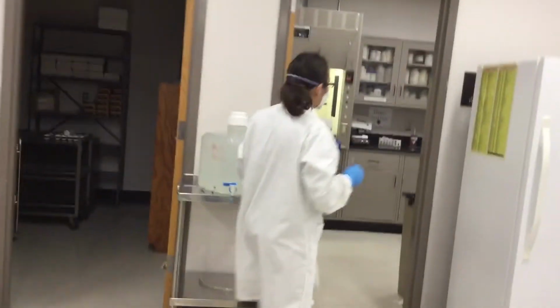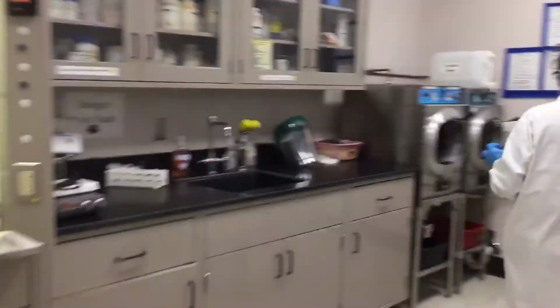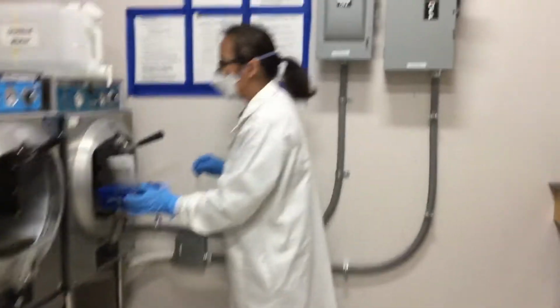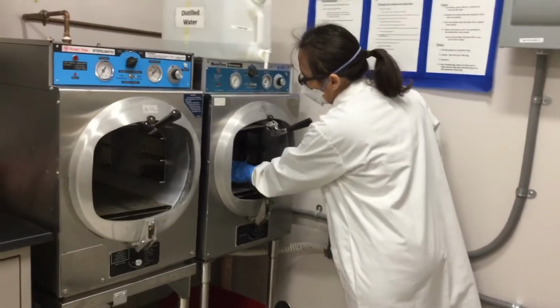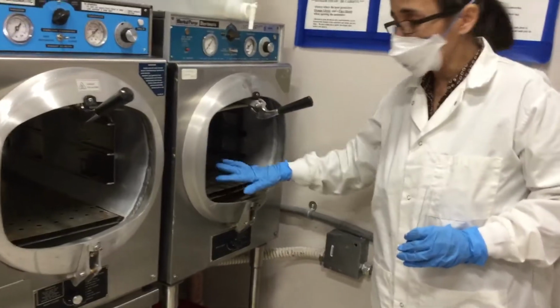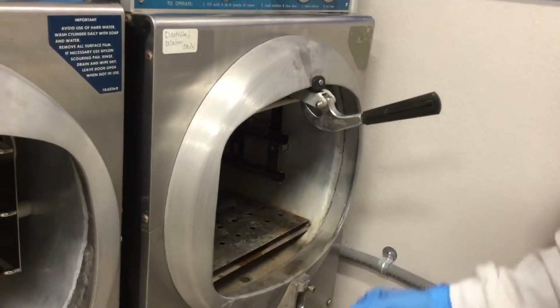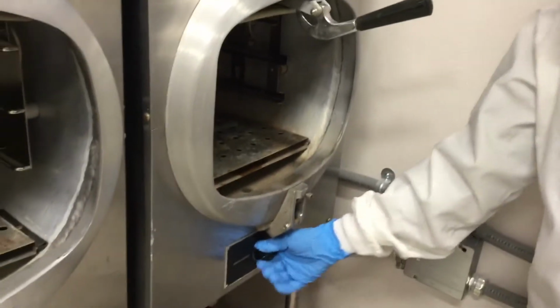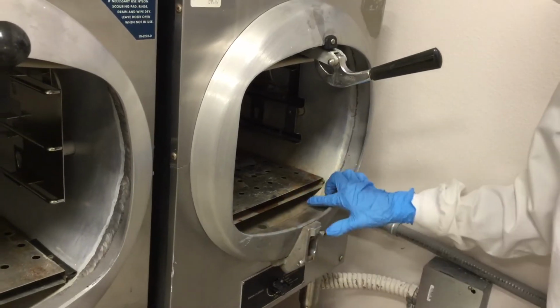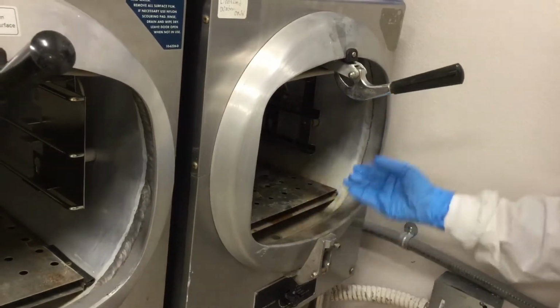So we have in this prep room we have here 2 autoclave machines. So these are specialized equipment. You will put your materials that you need to autoclave here. We have a chamber, and we have here this drain that has a valve, and I close the valve to add water. We add distilled water, and then we have to add the water up to this edge on the opening of the chamber.